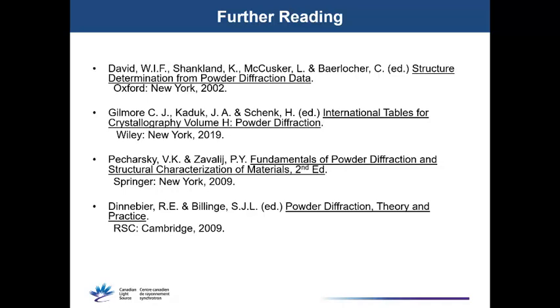Does the structure determination work if there are multiple phases in the data set? If there are multiple phases in the data set, resynthesize your sample. If you know what the other phase is, and particularly if it's minor, you can get away with going through the structure solution process, especially if you can identify the low angle peaks that are contributed by that second phase.